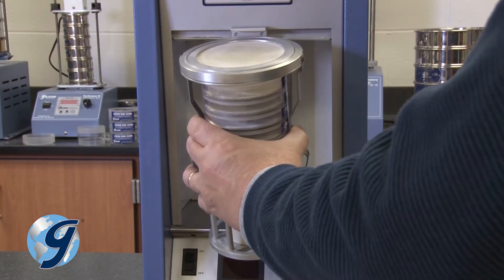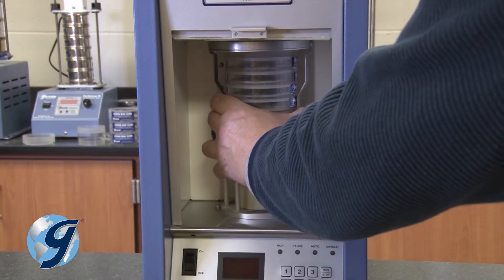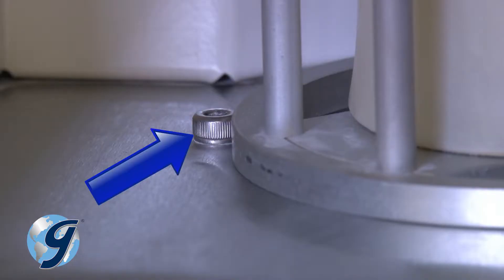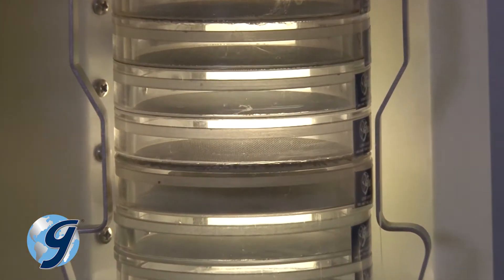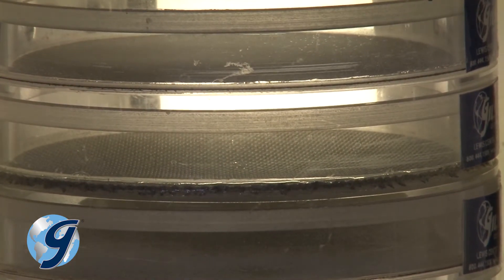Now insert the sieve stack assembly into the sieving chamber until it rests against the stops on the platform. Stacking the sieves with the labels facing to the side will allow unobstructed viewing of the materials during sieving operations.